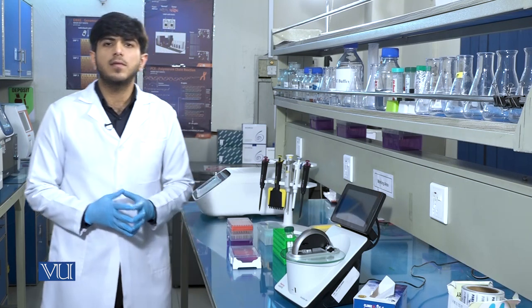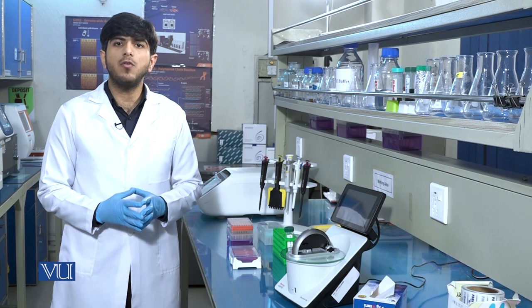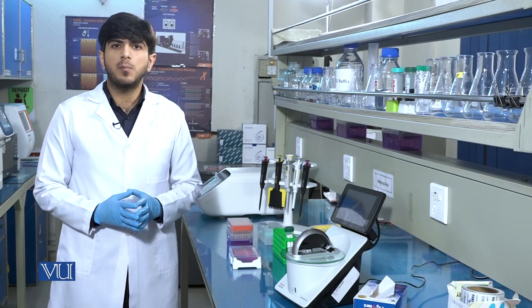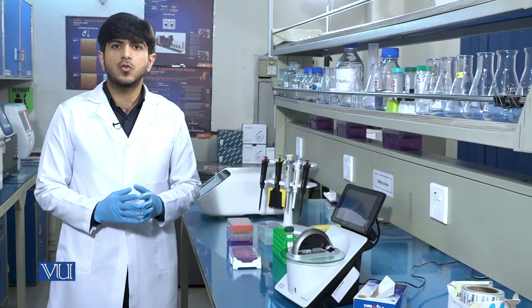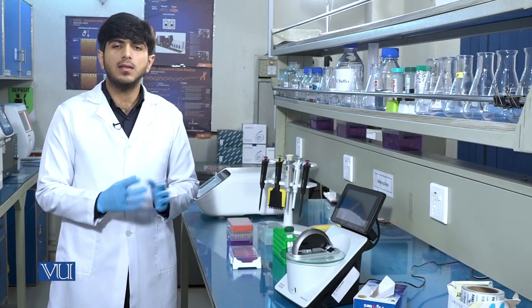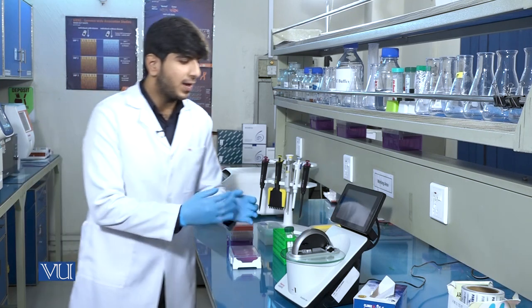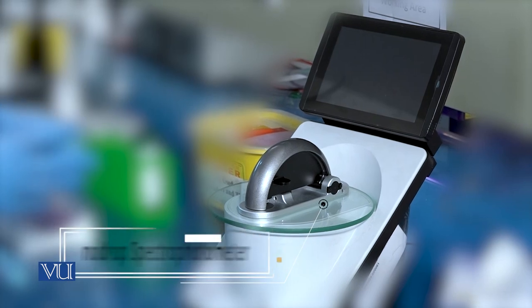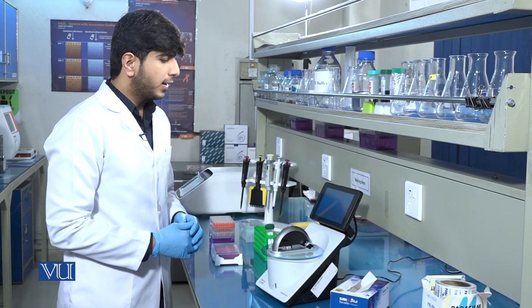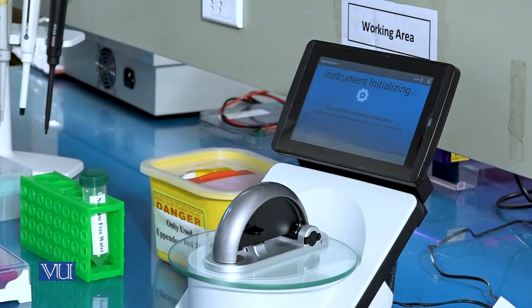The purpose of nuclease-free water is to blank the instrument. And why are we using the nuclease-free water? Because we have stored the DNA in nuclease-free water. So we will blank the instrument with this nuclease-free water. In the end, we have the Nanodrop UV visible spectrophotometer. When we turn on the instrument, it will take some time to initialize the software.